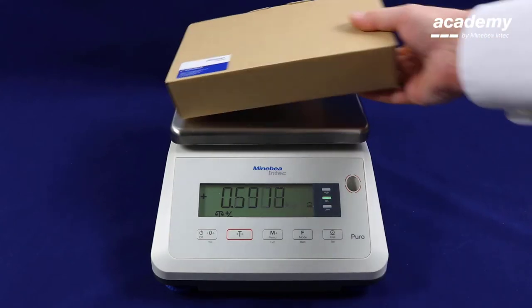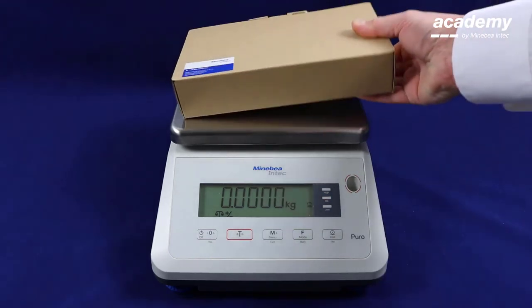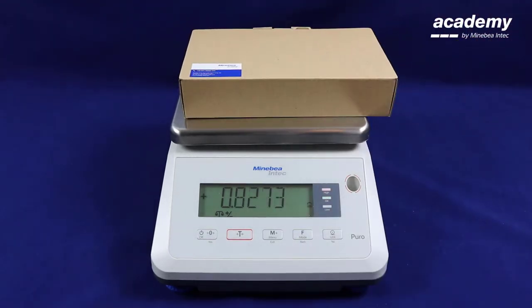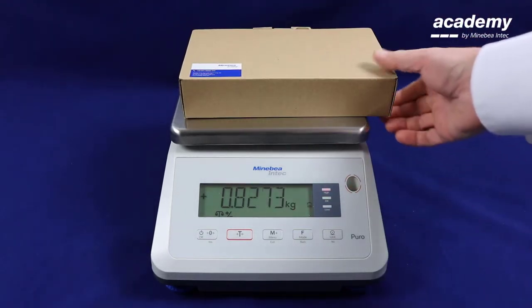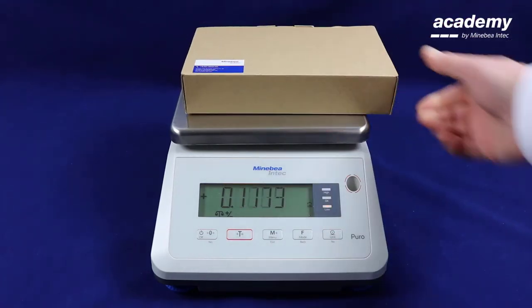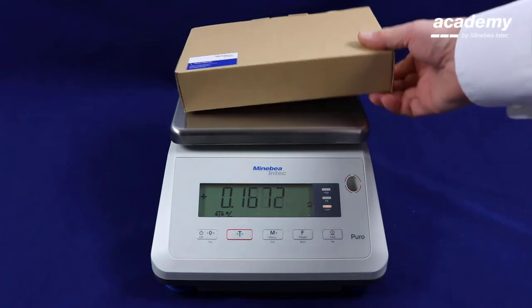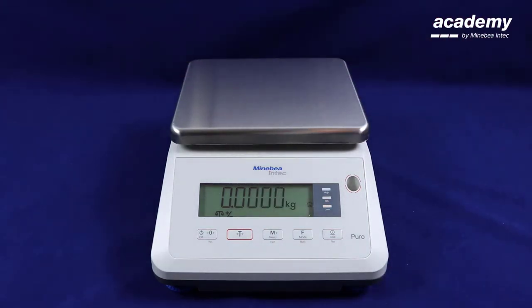This again is a good sample and is reflected with the green check weighing light. This sample is too heavy and therefore the red light is shown. This sample is too light and therefore the yellow lower tolerance limit has been exceeded.